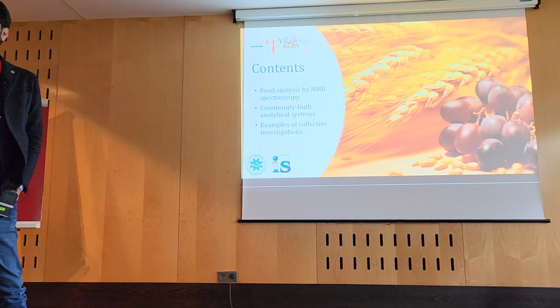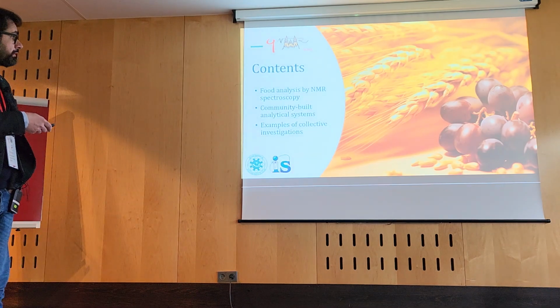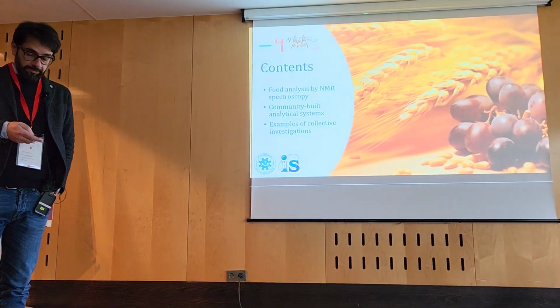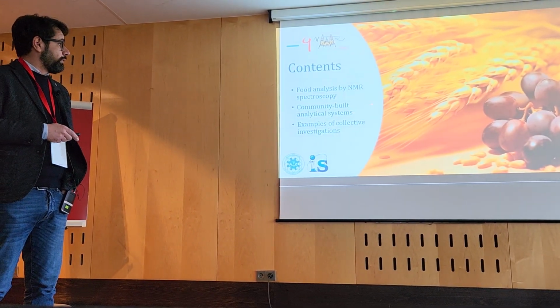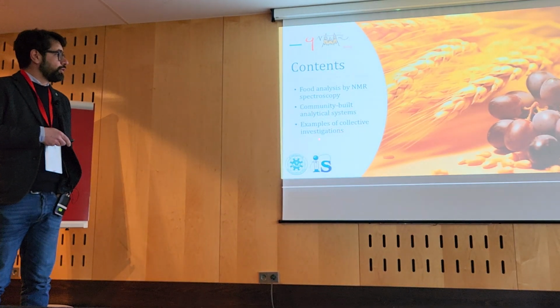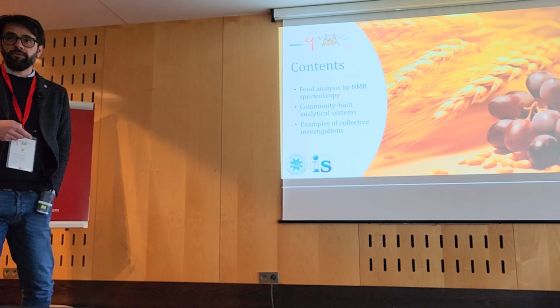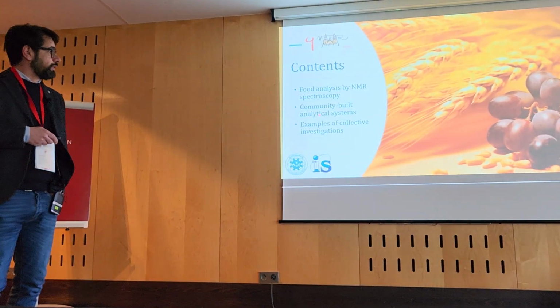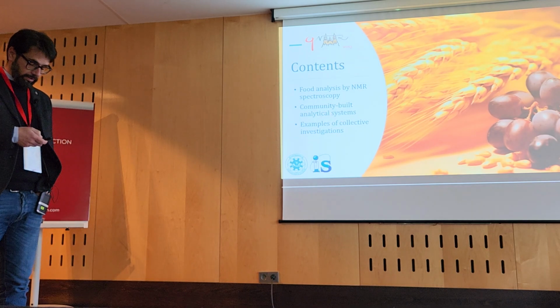In this presentation, I will spend a few minutes to introduce food analysis by NMR spectroscopy, and then what we mean by community-built analytical systems. And I will show you just a few examples of our studies, explaining what we are doing now with these systems.